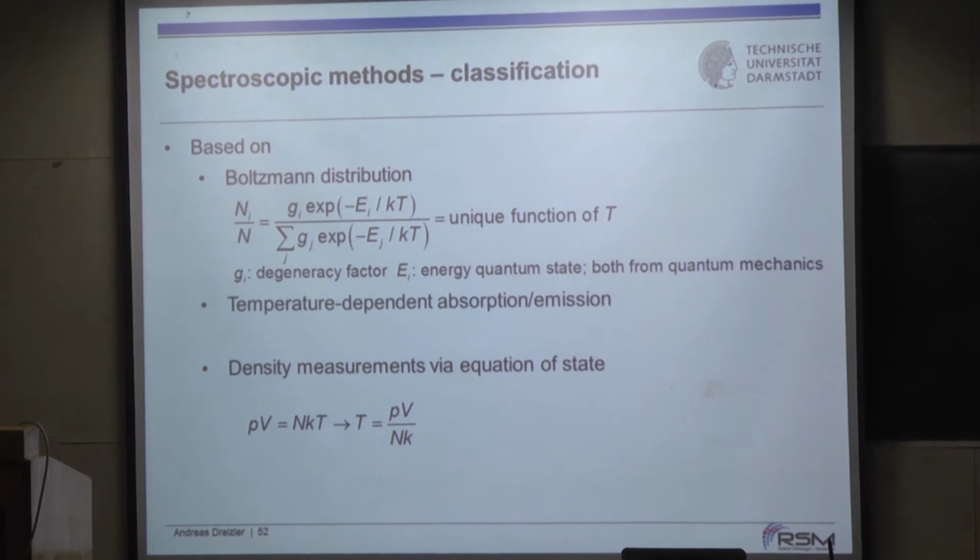Are there any questions? Then we can maybe finalize that here before we look into some examples by looking into the third method, meaning density measurements. Yes? That is correct. For toluene, the overall signal goes down with temperature. No, we take the absolute. We take the absolute. Yeah, you have to take the absolute.